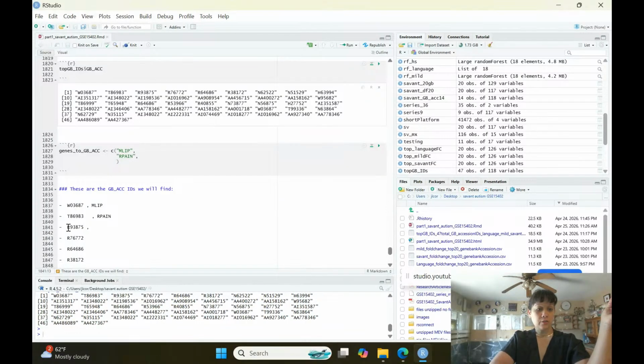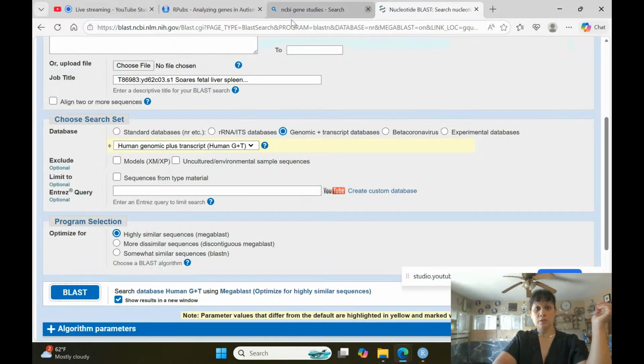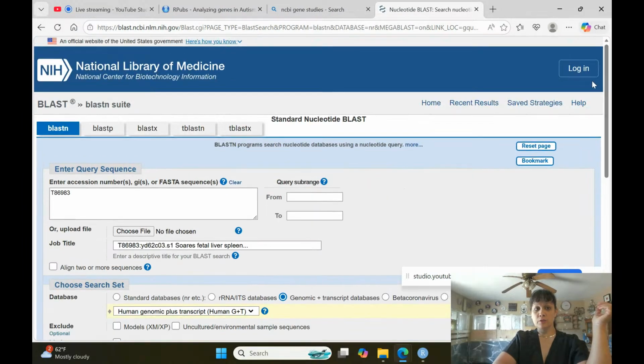And we're going to go ahead and search for our next gene bank accession number. So for that one, we'll just close this window, close this window. We'll go back to the original window, Control V for our new third gene bank accession ID.